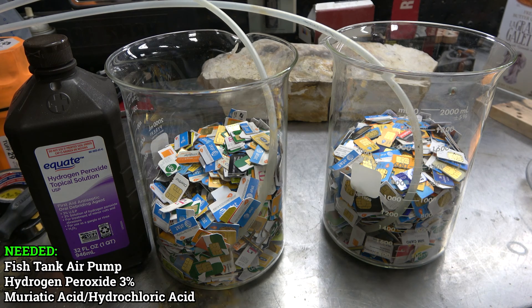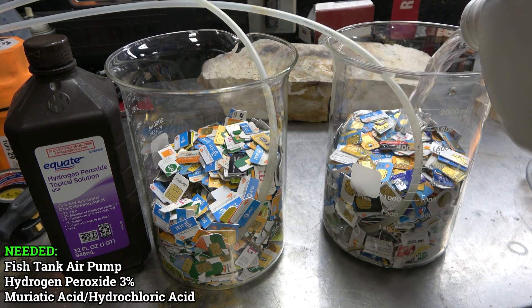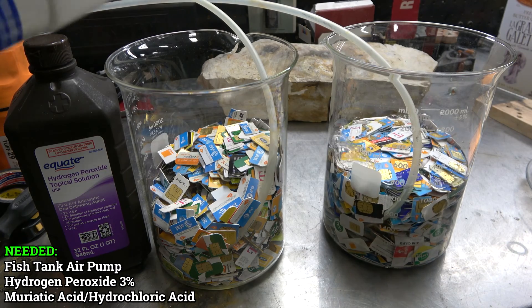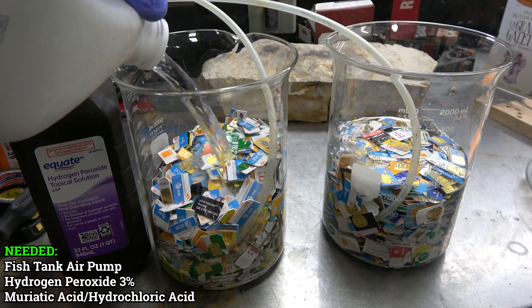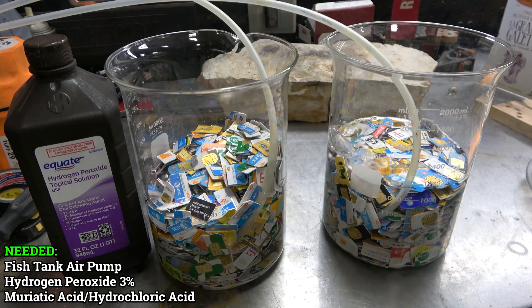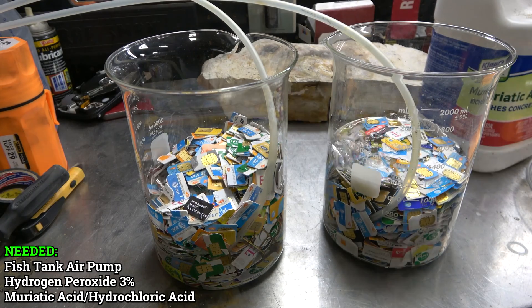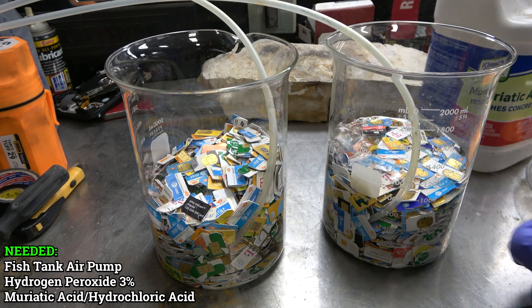I'm going to use muriatic acid, which is hydrochloric acid - you can pick that up at Lowe's, Home Depot, or your hardware store. I'll fill it just under the top of the cards, and then for this batch we'll use hydrogen peroxide at 3% concentration - about half a bottle in each beaker. What will happen is it's going to loosen the foils off the cards, though it does take quite a bit of time.